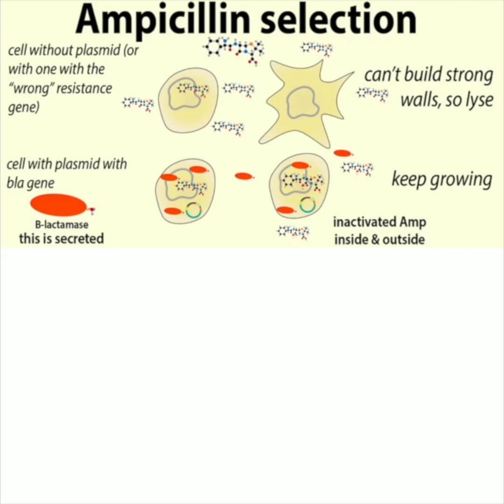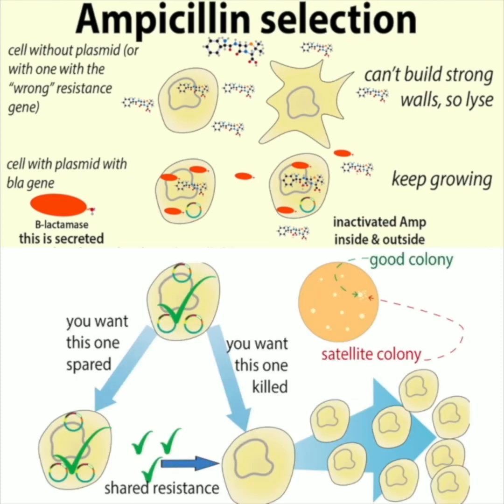A problem to be aware of with ampicillin selection is that the beta-lactamase gene product actually gets secreted. It can provide resistance to nearby colonies, and this is bad because those colonies might not even have the plasmid in them — they get the benefit anyway. Basically, ampicillin resistance is going on the offensive and attacking the antibiotic before it can even get into the cells, but this prevents it from killing some of the cells you want killed. This is mostly a problem if you overgrow the plates. Typically, these false colonies will form as little satellite colonies nearby the big gooey colony — those probably don't have the plasmid and have just gotten help from the secreted beta-lactamase.